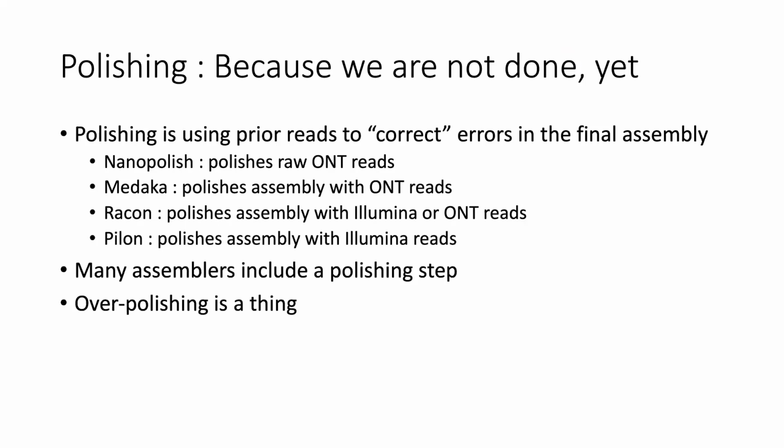So finally, and I don't have a picture for this, polishing is when you take files prior in your workflow, and you use that to correct the final assembly.